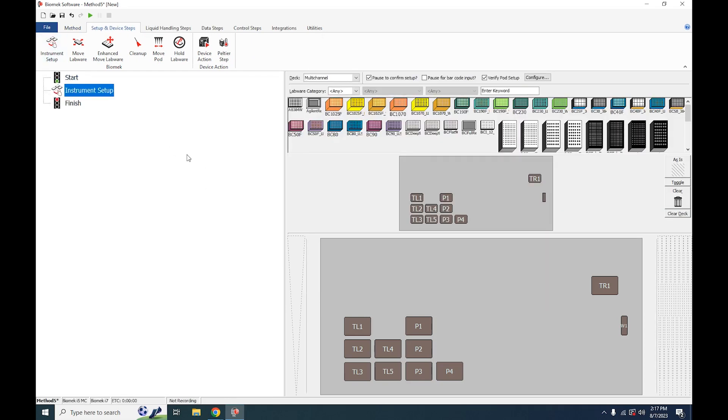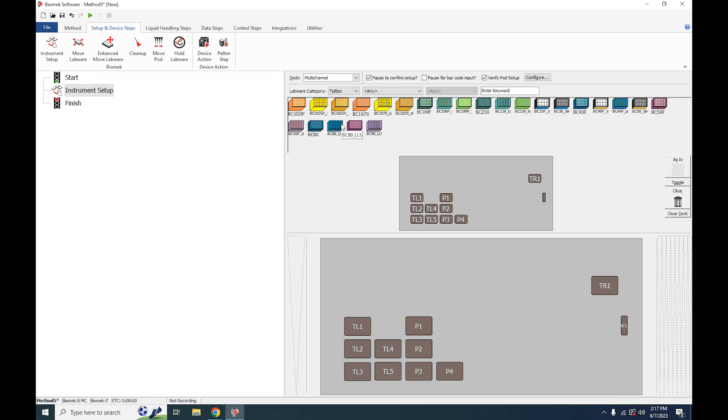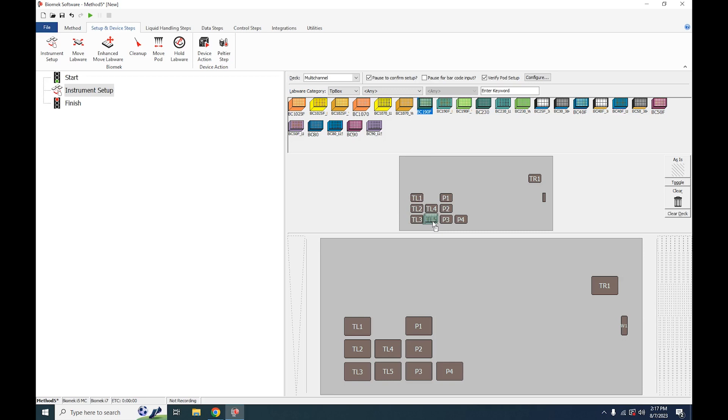Part of our setup, the first thing is going to be our tip box. We're going to go under Labware Category and choose Tip Box. After that populates, you're going to choose whichever tip box type you're using. In our case it's the 190 filtered, and drag and drop it to the position on the deck that you will use. For us it's TL5.